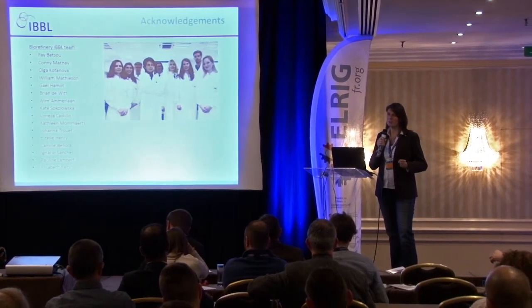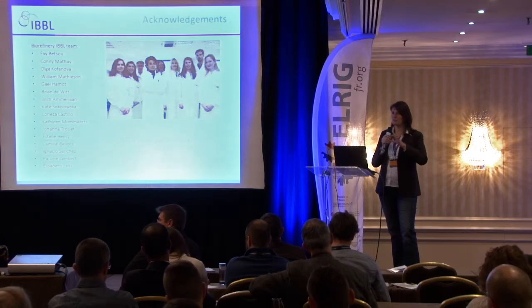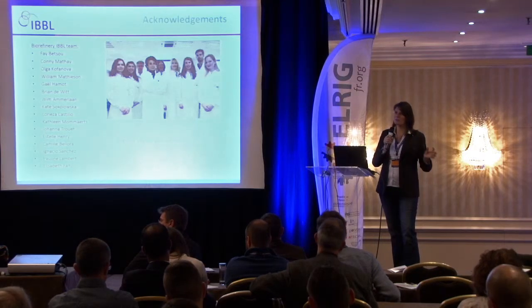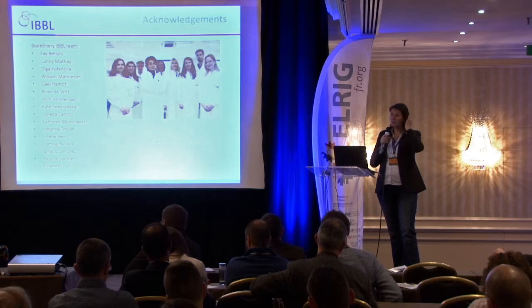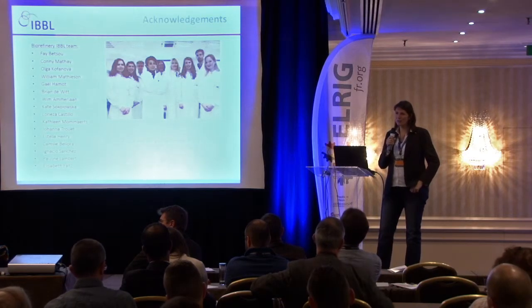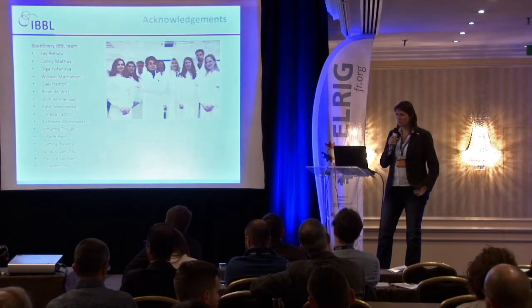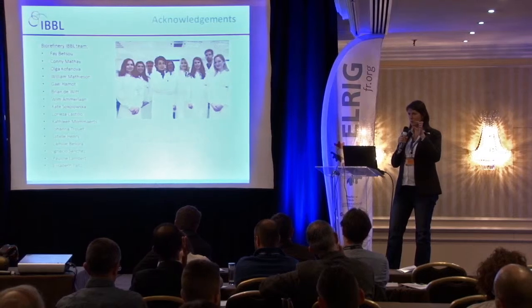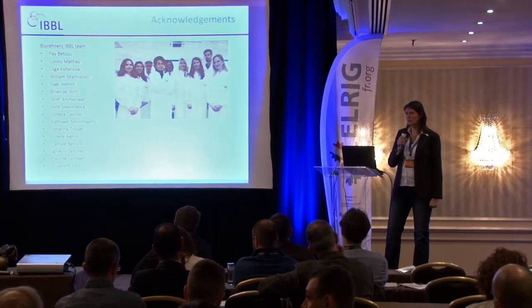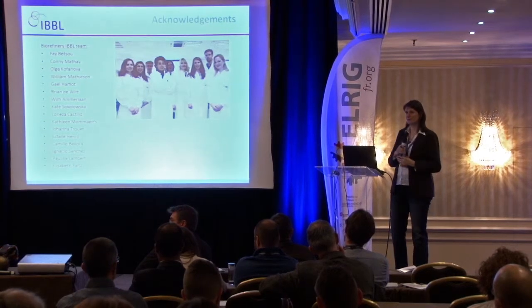In the beginning, we wanted to store it in 3 aliquots, but this was getting very difficult because you do small aliquots, and each time you do an aliquot, you have a little bit of volume loss. And so we decided to go for 1 aliquot, and normally we have elution volumes around 250 or 300 microliters, so it just fits into our 0.5 tubes. So we went for the 1 aliquot storage.